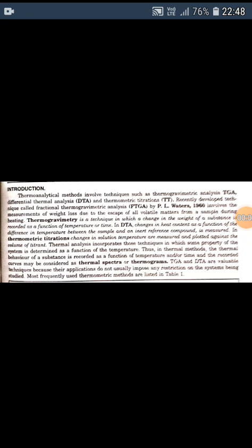Thermogravimetric analysis is a type of thermoanalytical method. Thermoanalytical methods involve those techniques such as thermogravimetric analysis, differential thermal analysis, and thermometric titrations. Another technique which has been developed is known as fractional thermogravimetric analysis. These techniques involve the measurement of weight loss due to the escape of all volatile matters from a sample during heating.